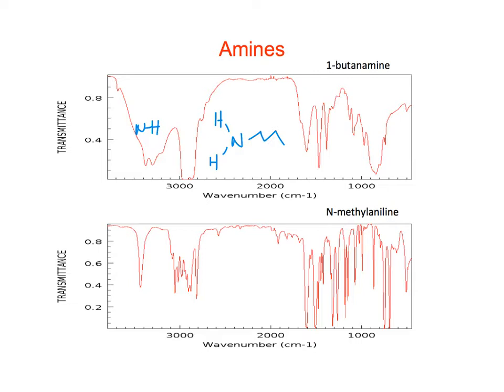So if we have this primary amine, we see at least these two peaks. It looks like there are some other peaks in that big thing, but we see the tips of two peaks. And I think it's probably from symmetrical and asymmetrical stretches. And then we have the CHs and a lot of the same things. We'd have to look this one up. It seems like that could be the carbon-nitrogen stretch, but I'd have to look that one up for sure.